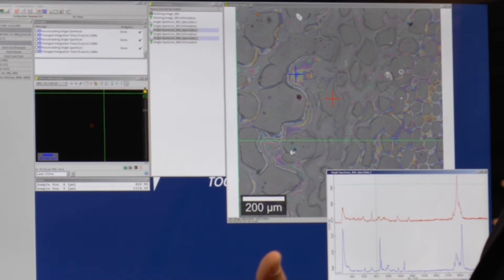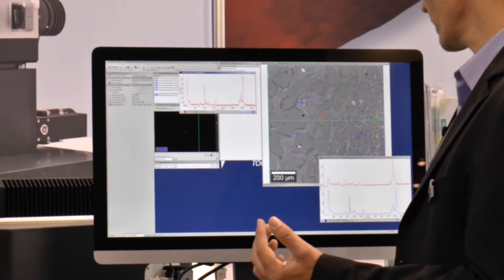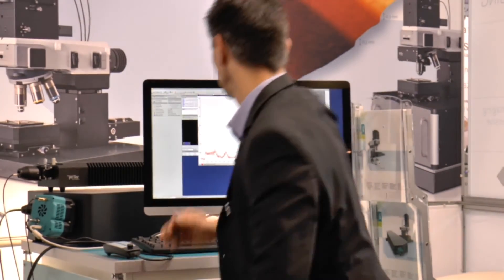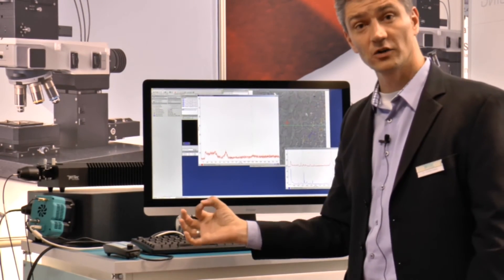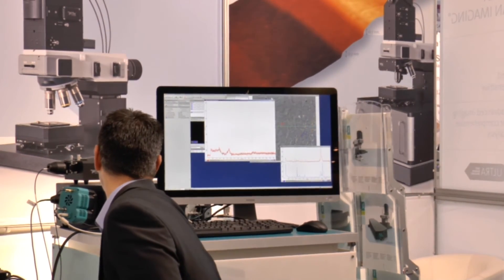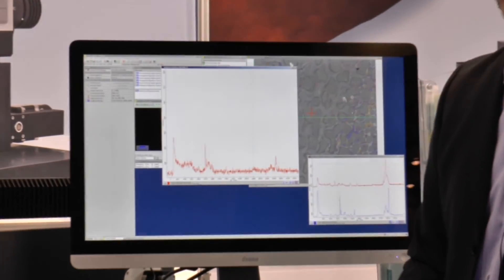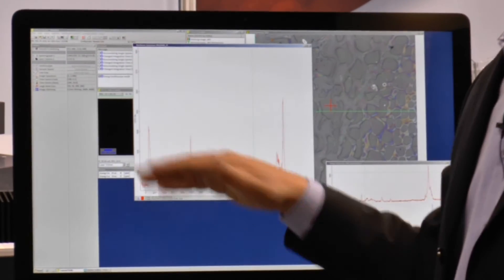The confocality is extremely high. This is the live spectrum now with half a second integration time. If I change the focus only a tiny little bit, we are instantly inside the glass — that shows the high confocality of this entry-level system. You don't see any polymer anymore, just glass. Moving a little bit upwards again, we have the polymer spectrum again. At a position with both, moving a little further, we see very nicely polymer and no glass at all.